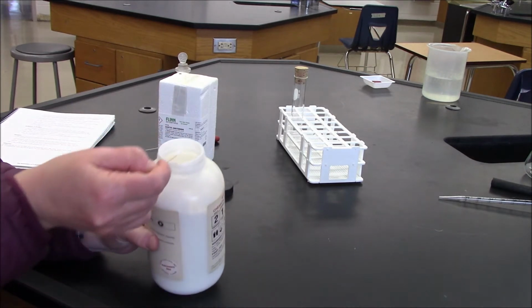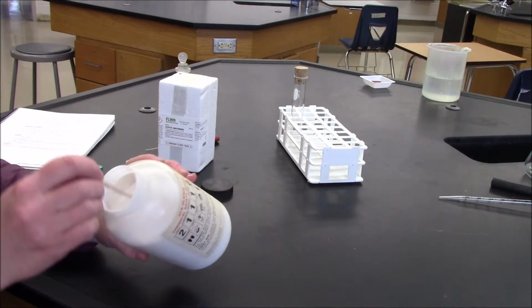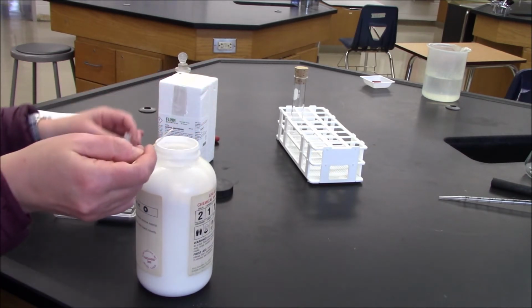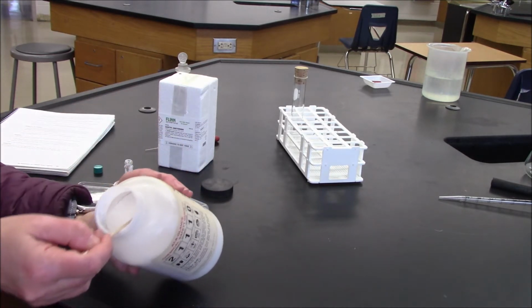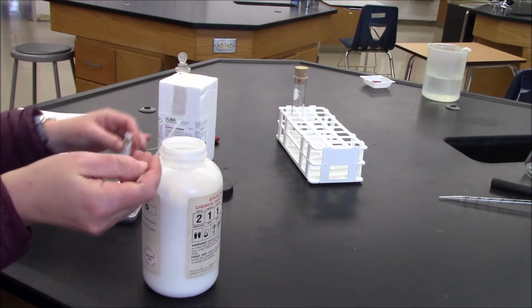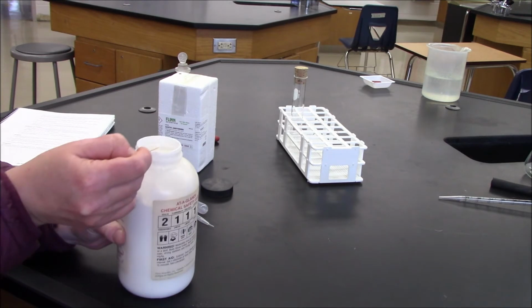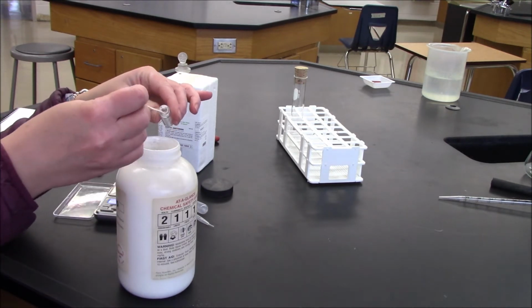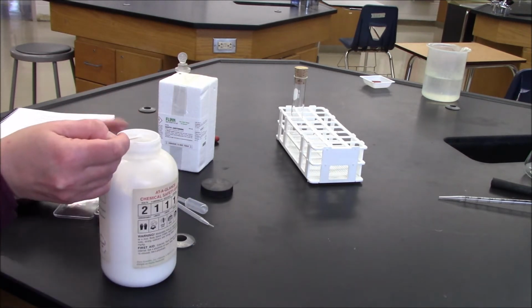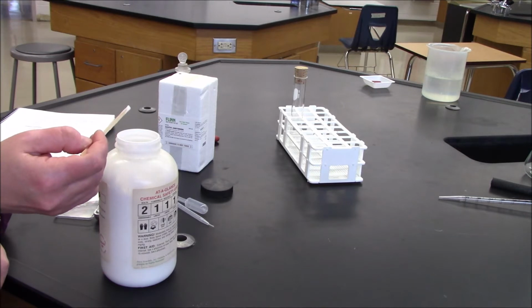I'm at 0.5 grams. 0.6 grams. 0.8 grams. 0.87 grams. 0.99 grams.